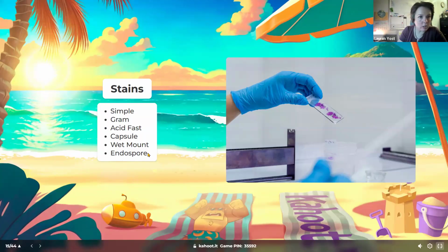So paper towel is not a mordant. The paper towel didn't actually actively participate in the stain, and the stain works without the paper towel. It's just harder to get it to work properly.